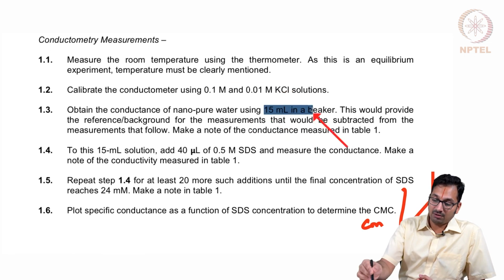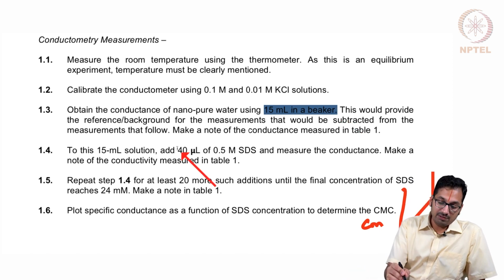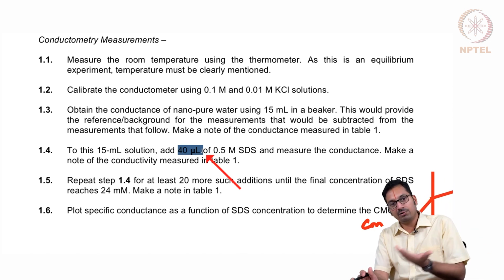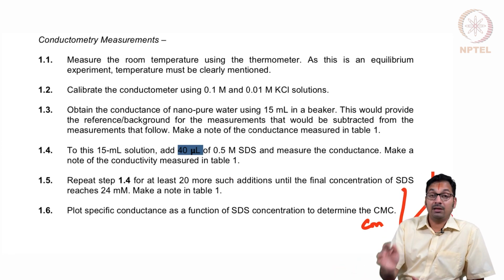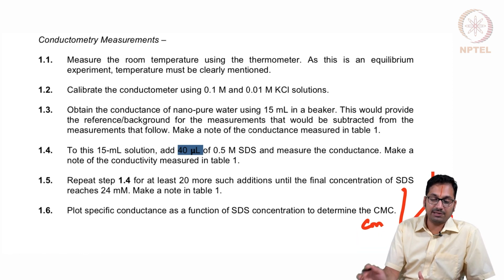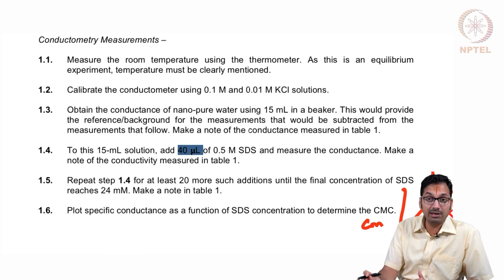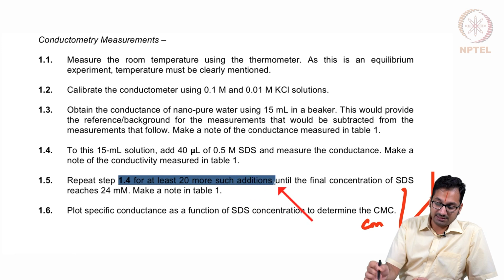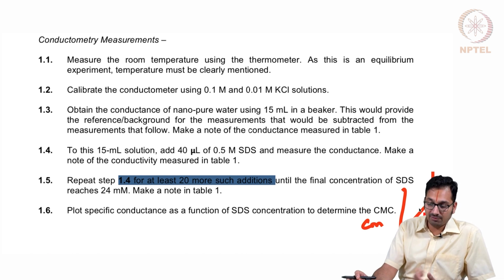On the other hand, let's say you are trying to add 15 ml of solution into the beaker, you add 16 ml or something slightly different from that, or when you are adding a certain amount of SDS, you add varying amounts. One time you add 39 microliters, when you add 41, sometimes 40. This ends up also resulting in the curves that don't look perfect. If you remember, the first researcher that we ended up seeing, 6.3 millimolar was the SDS concentration for CMC. We realized that that is wrong, and it comes up close to something like 7.3 or 7.4 millimolar, and that could be one of the reasons why the mistakes came up. And of course, you have to do enough measurements such that the curve looks proper, such that you can carefully estimate the CMC of that given surfactant.